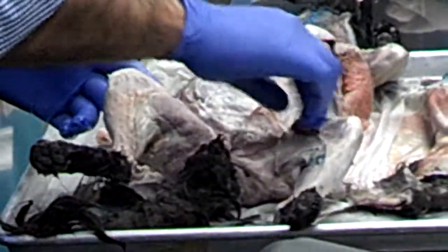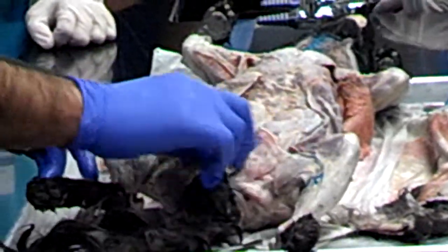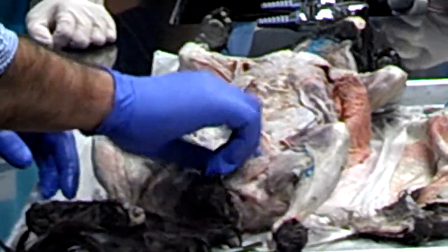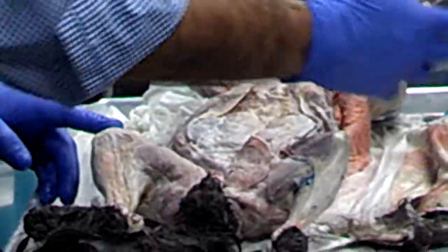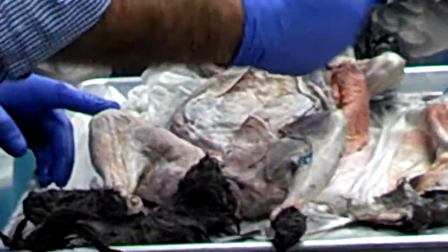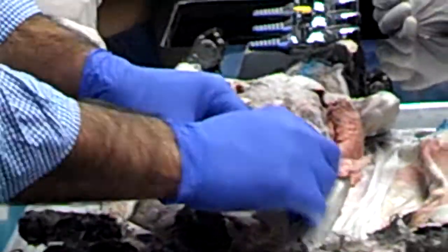Did everybody get it? So this is the landmark here. This vein is our femoral vein, okay? On this side, the outer side of the femoral vein, is your sartorius, and on the inner side is your gracilis. So I reflected this sartorius.